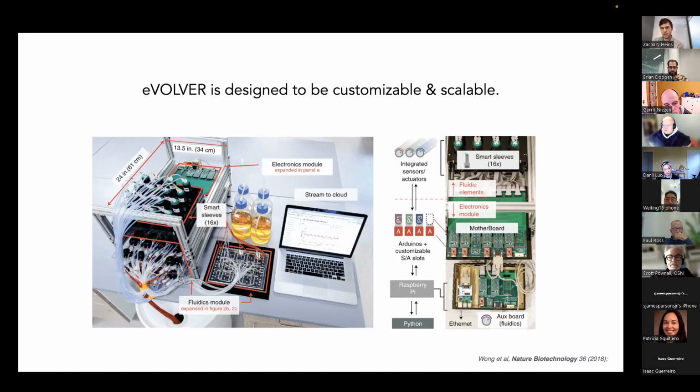There's also been people playing around with the idea of having a single measurement unit, like a flow box, where I want to take, let's say, luminescence, just as an example. I have a luminometer. I can flow per vial into that device and then correlate that data back over something like RS-232 to the system to associate it with my experiment. So those are the ways. There's lots of ways to do this.